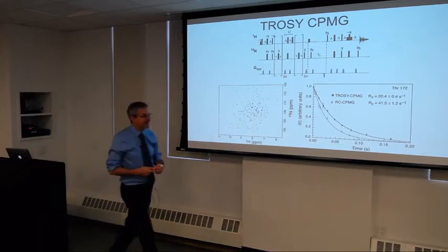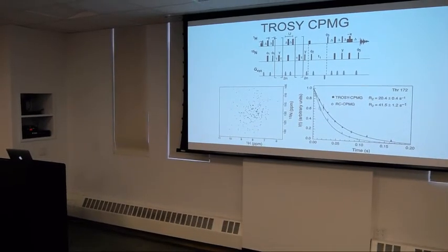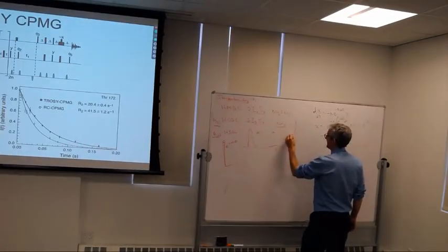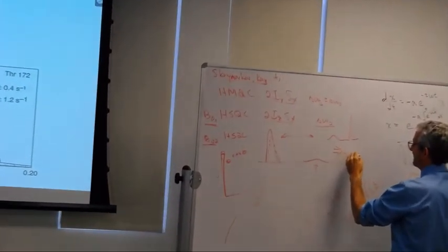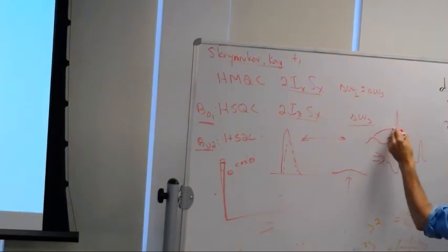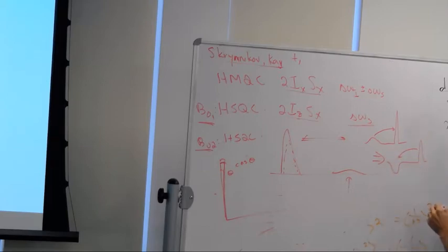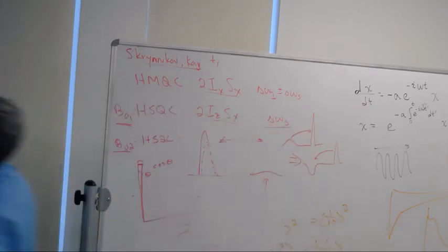So if we start out with our broad line and narrow line having the same phase, later on we want to flip one of them, so that if there's cross-relaxation going this way, later on we have cross-relaxation going back that way to try to undo the effect. So this is a pulse sequence element that just does that.